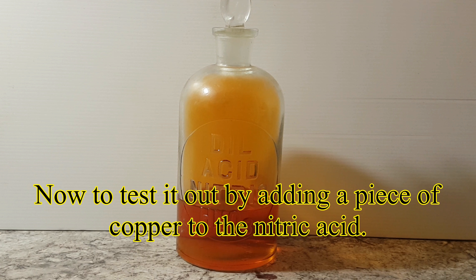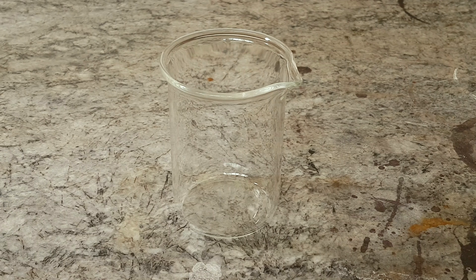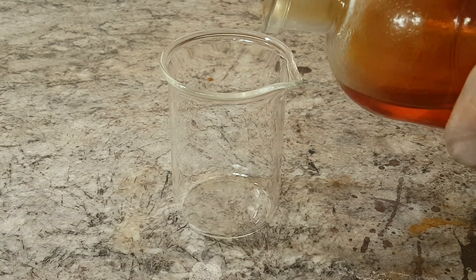Now to test it out by adding a piece of copper to the nitric acid. Nitrogen dioxide was produced, which is a perfect indicator.